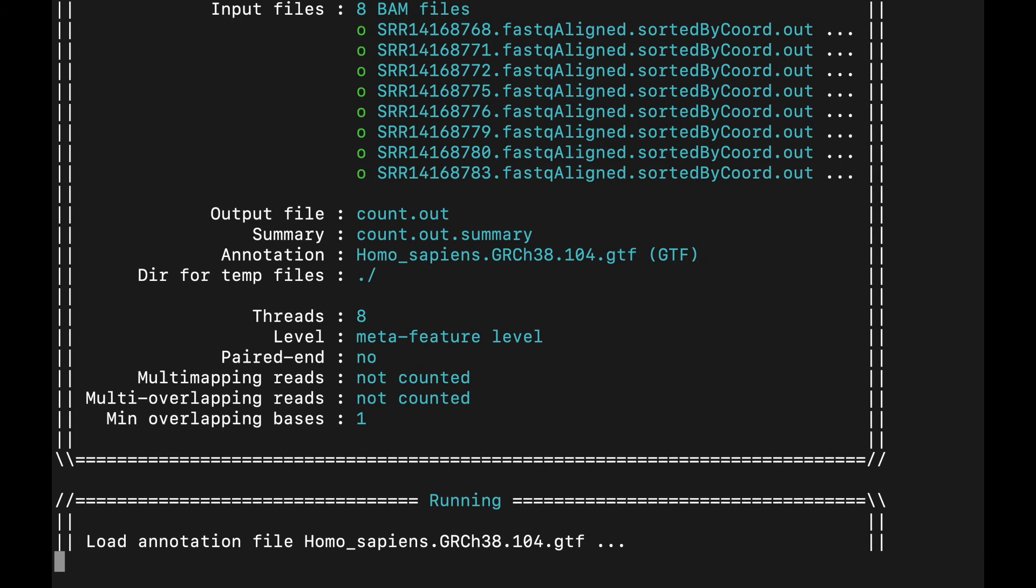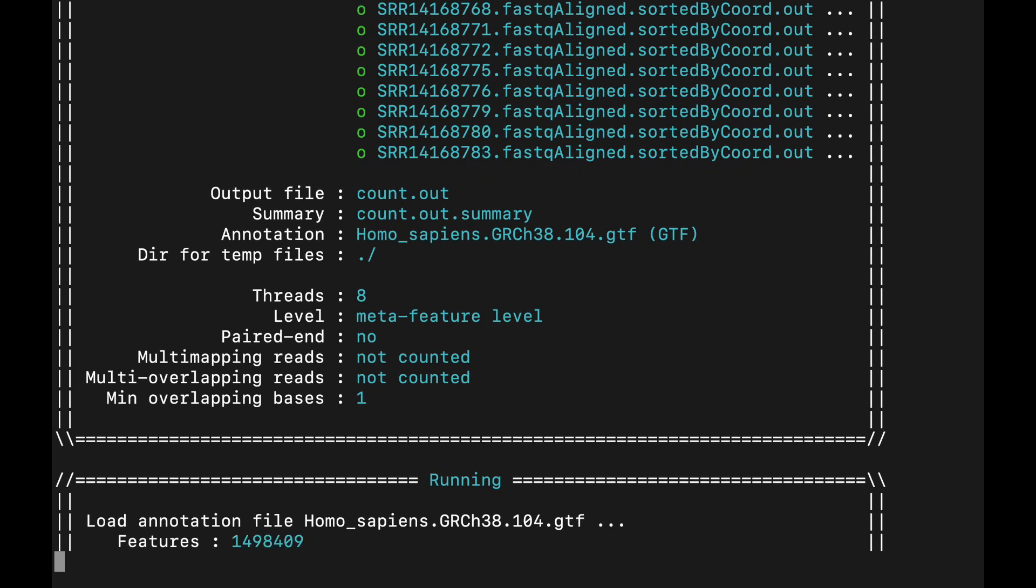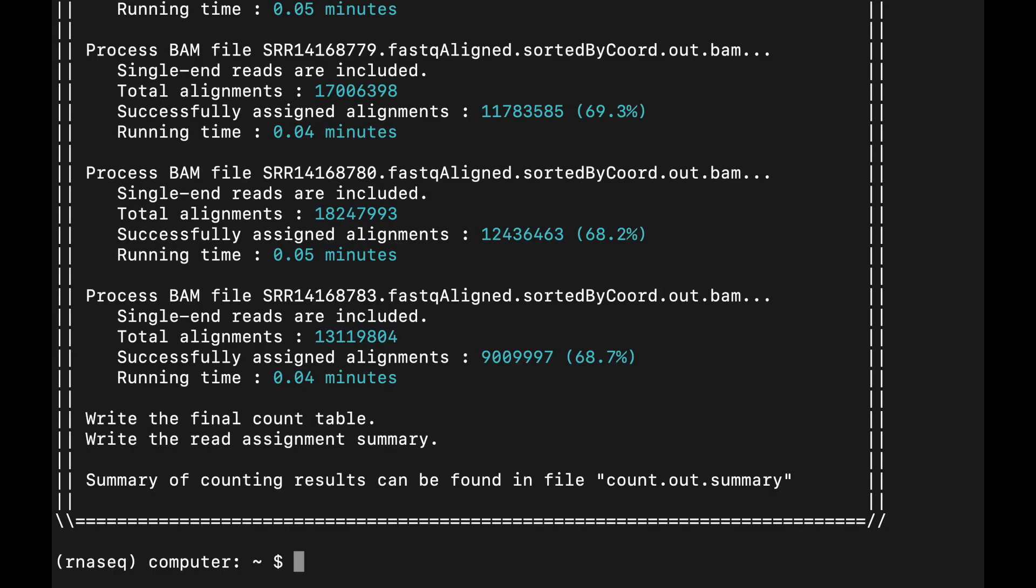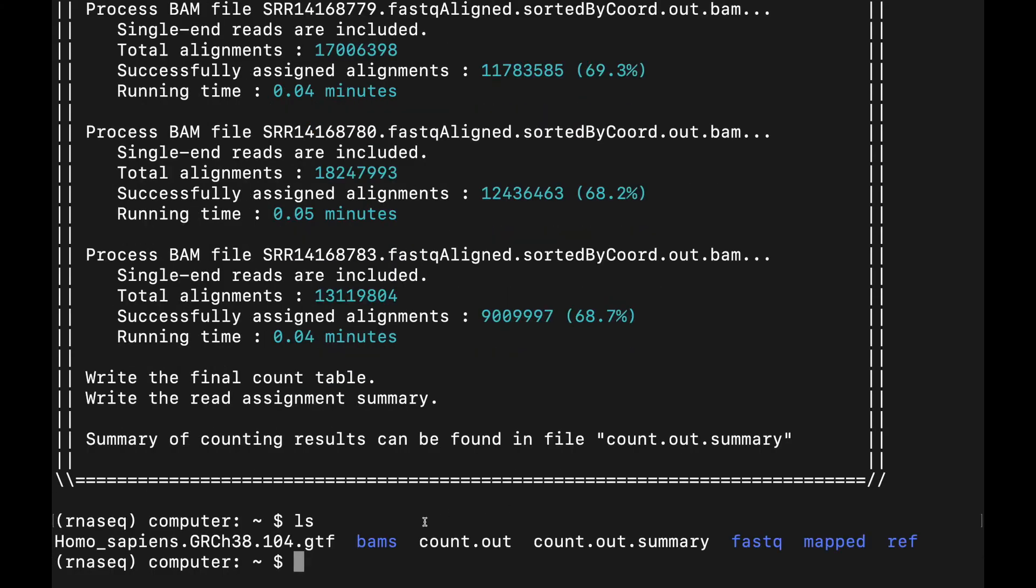And this should only take a couple of minutes to run. It's pretty quick. Once it's finished, you should see this counts.out and this counts.out summary file.